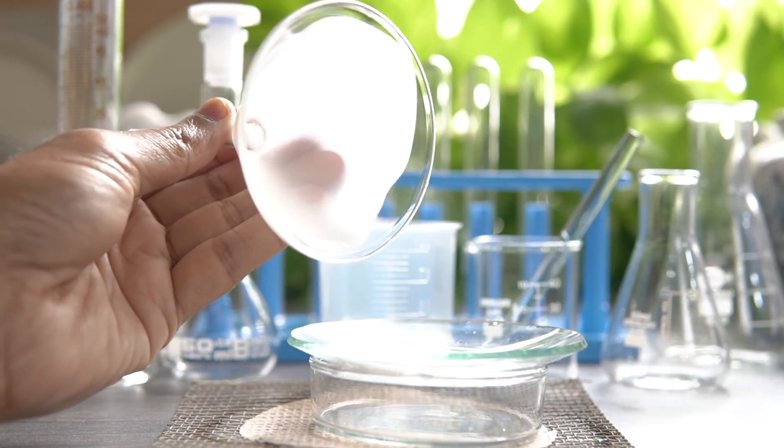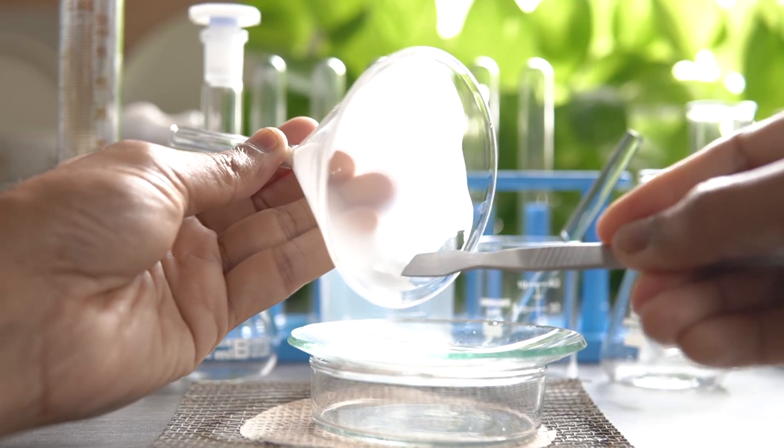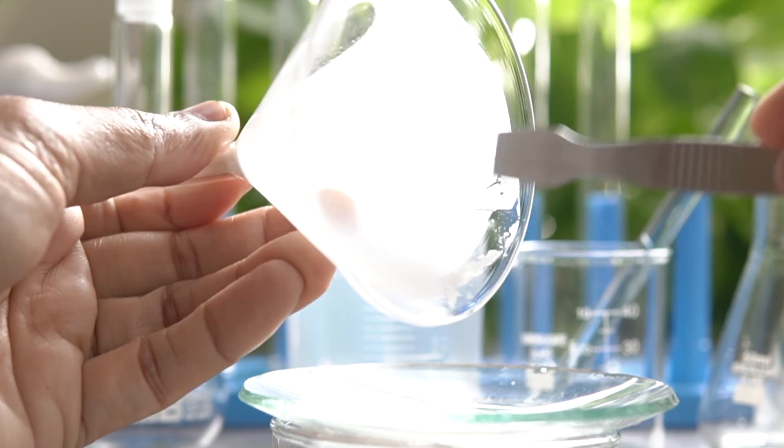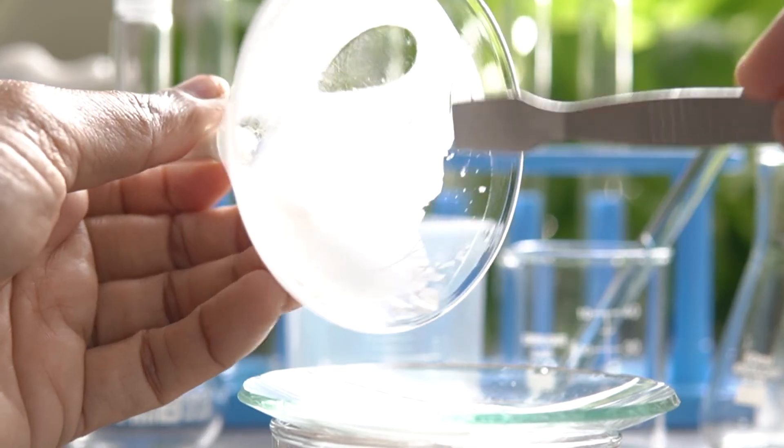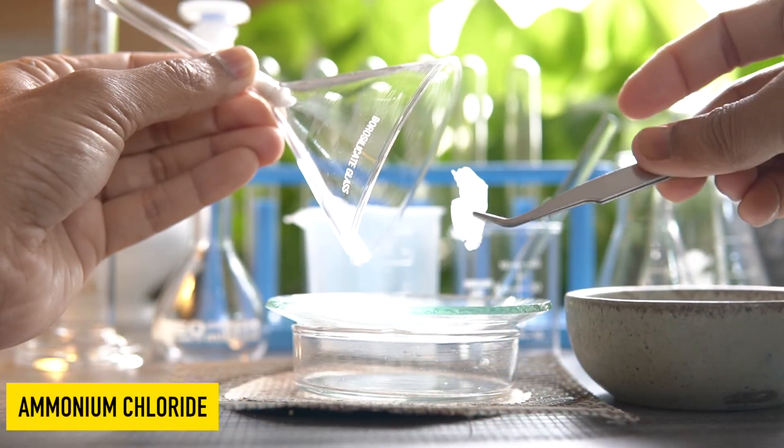We can easily collect the solid ammonium chloride from the inner surface of the glass funnel using a scraper. By using this technique, we can easily separate a mixture if one of the components sublimes.